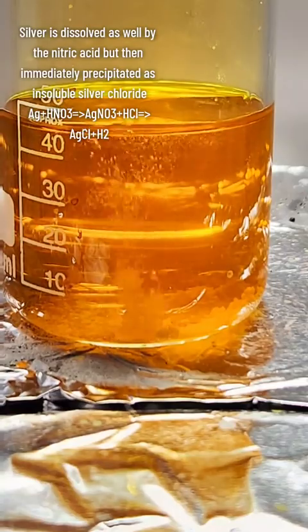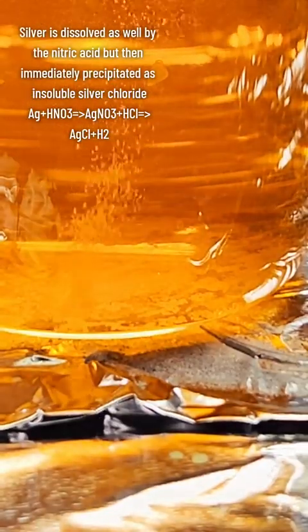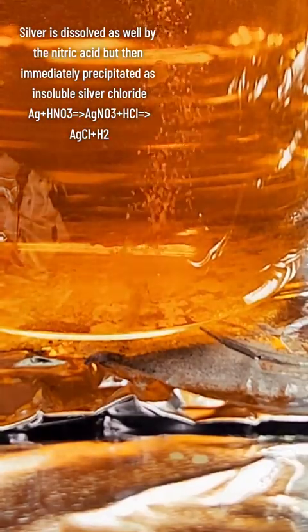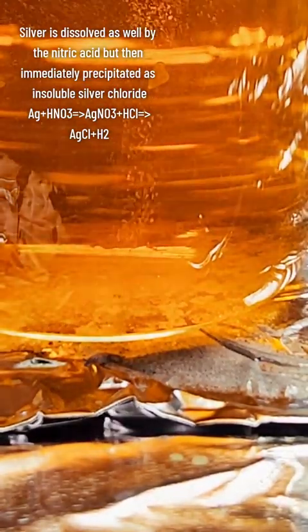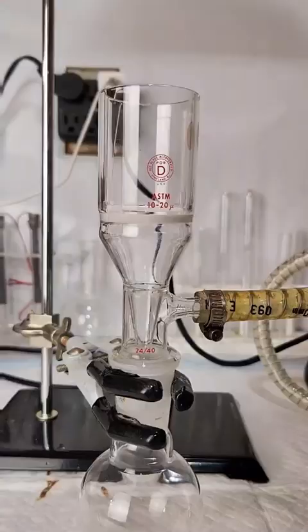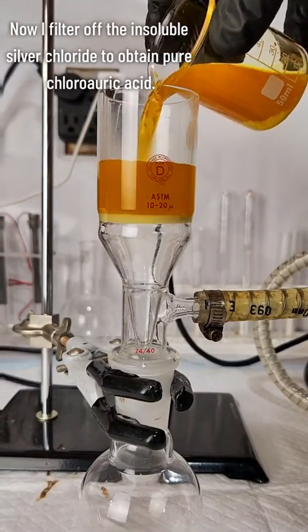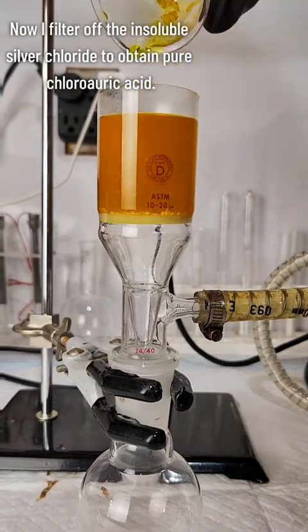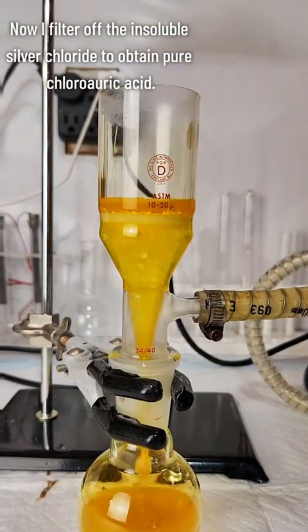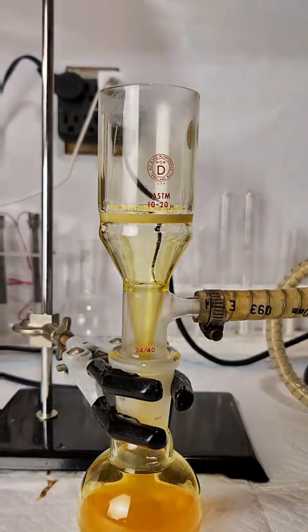While this is going on, silver is also being reacted by the nitric acid into silver nitrate, which then immediately reacts with the hydrochloric acid to form silver chloride, which is an insoluble salt and really easy to filter off. Once my gold is completely done dissolving, I pass the solution through a Buchner funnel to remove the insoluble silver chloride and leave me with pure chloroauric acid.